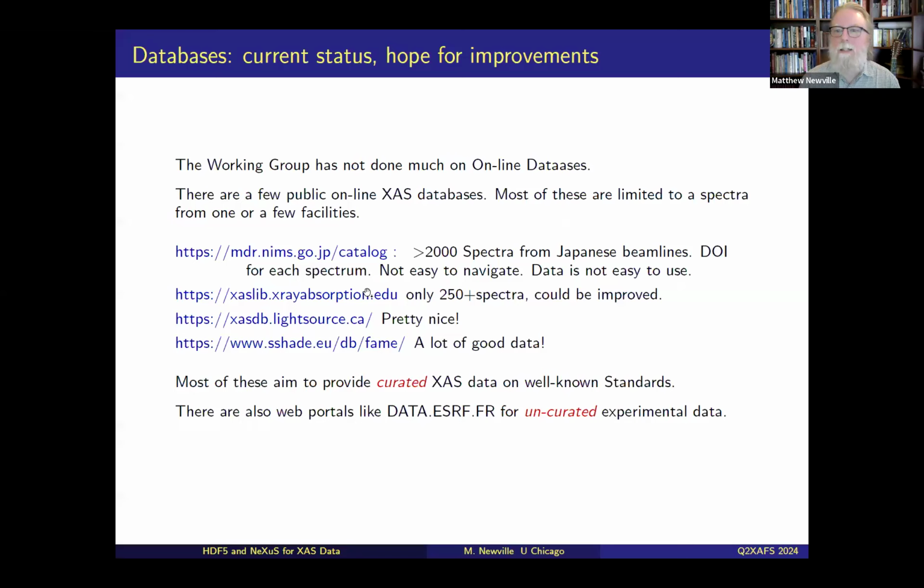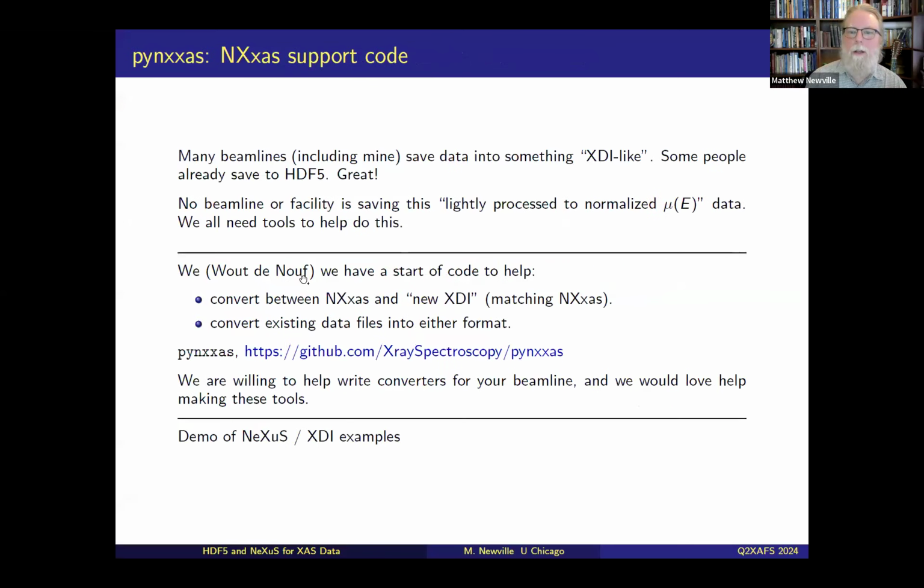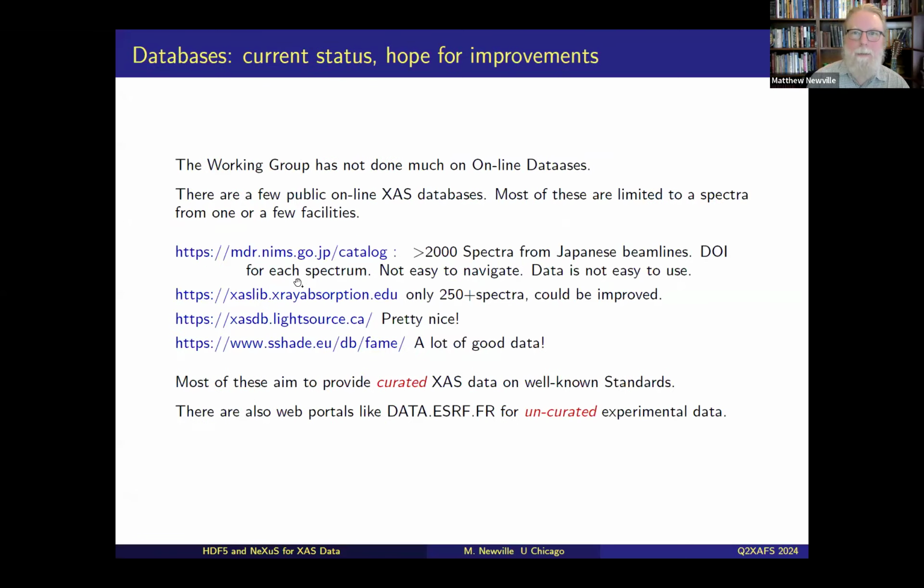I have a few more slides. Okay, so a few more slides on databases because this topic also sort of covers databases. And the working group has not done much on it because we felt like we need to get this done before we're ready for databases. There are a few public online databases. Here's a couple and my own take on them.